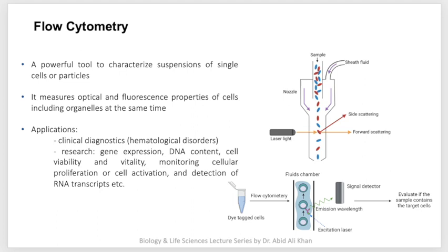Last but not least, in simpler terms, is the fluorescence detection. As we see in the figure below, we have a flow cytometry analysis figure with dye-tagged cells, and these cells can be labeled with any fluorescent dye or with antibodies, and to the antibodies there would be some dyes attached, capturing specific targets.